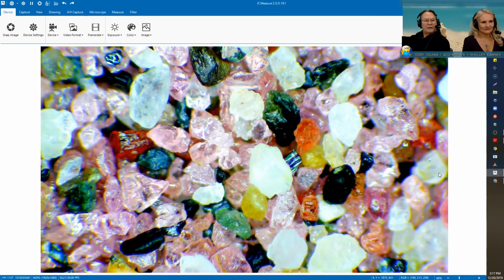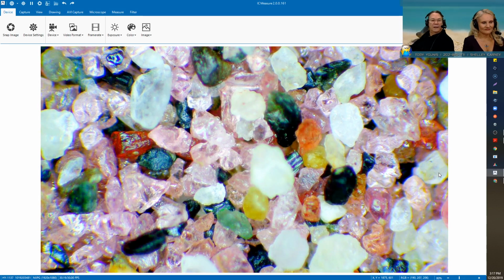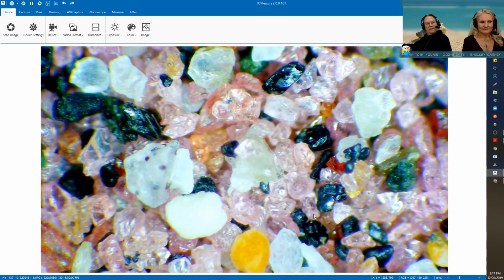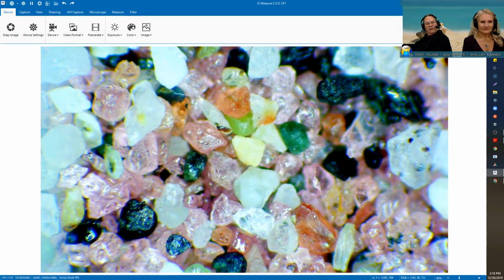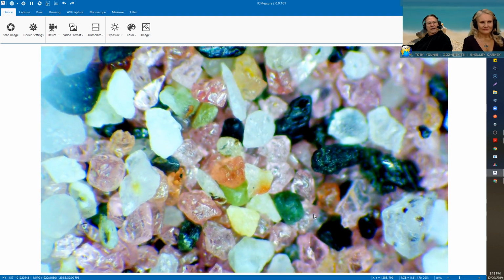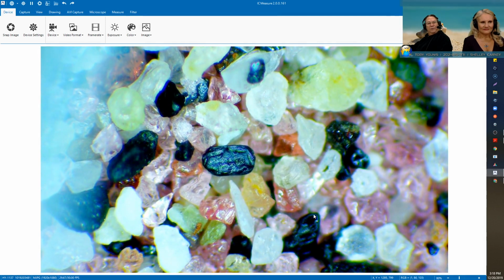And that's just one area. And as you can see, there's just all kinds of things happening: blue and red and green and translucent clear and the pink just in that one area. Let me slide it across and you can see the transition as it goes from primarily white into the pink area. It's hard to tell on the stereo microscope. But there's three shades of green in there, including two translucent and a solid. So it's a pretty amazing sample.